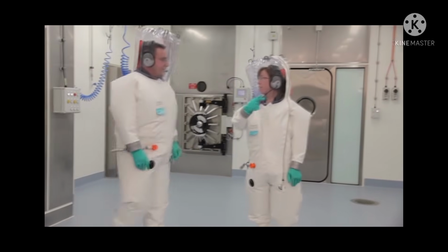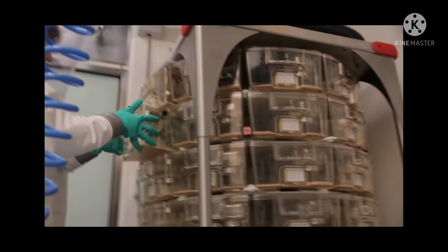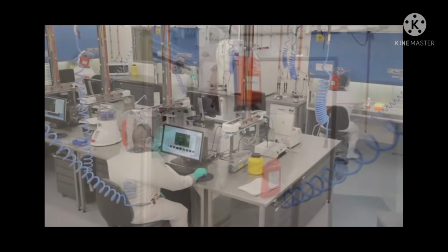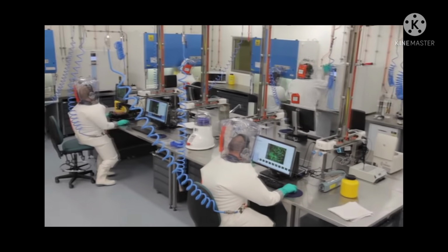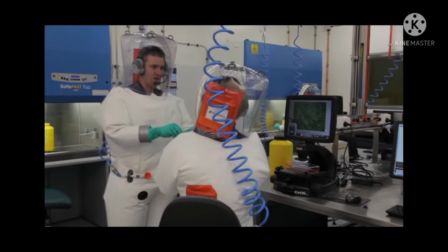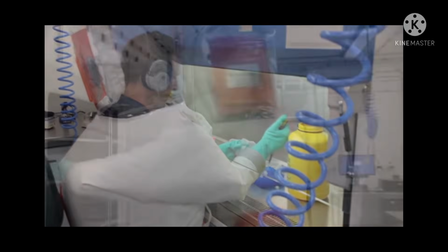The ACBRF provides scientific staff with an opportunity to work with small laboratory animals, including insects, inside 3 spacious animal rooms. There's also an ante-room for equipment, including freezers and centrifuges, and a large general laboratory. This general laboratory is unique, as it allows up to 12 scientists to work at any one time within the specialised space on research of national importance at the highest level of biosecurity. It has 5 independent workstations and features state-of-the-art equipment, including Class 2 biological safety cabinets and incubators.